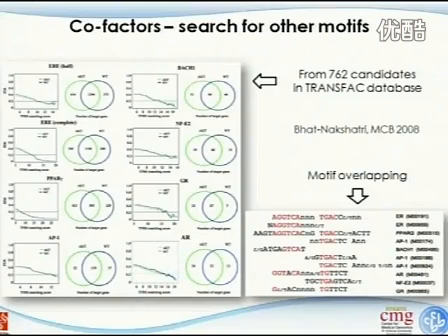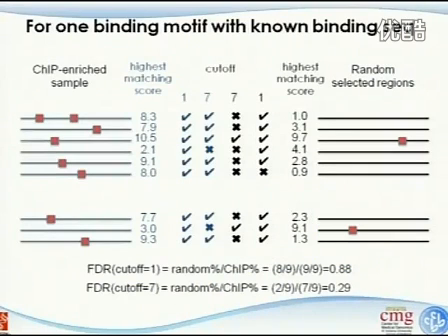There's one more thing that I want to mention here, there are some considerations when you select random regions. Okay, so there's one part that is the ChIP enriched regions. This is kind of straightforward. Whatever ChIP peak caller peak you identified, I'm fine with it, and you just search your motifs in this region. And the second one here requires a little bit of consideration.